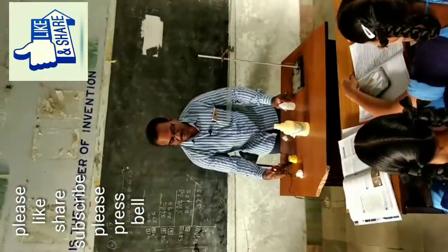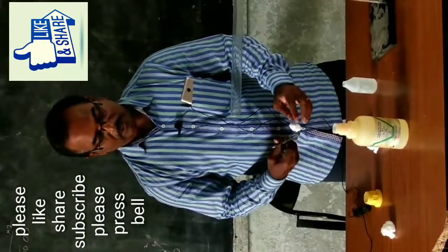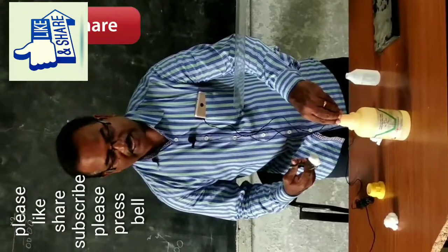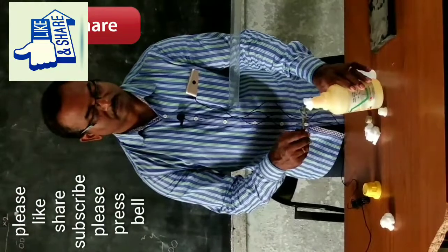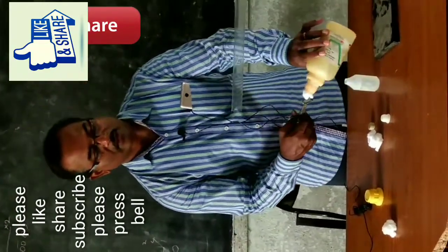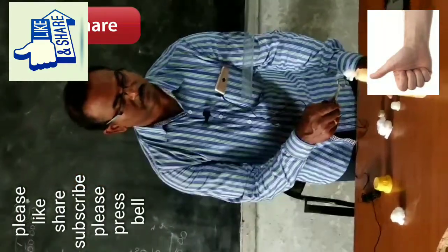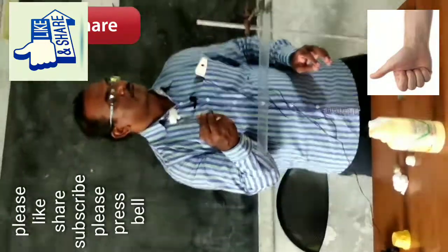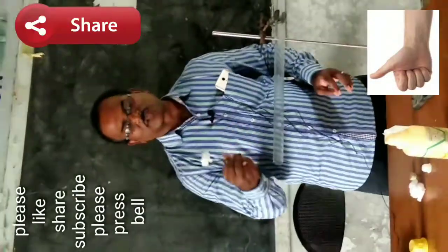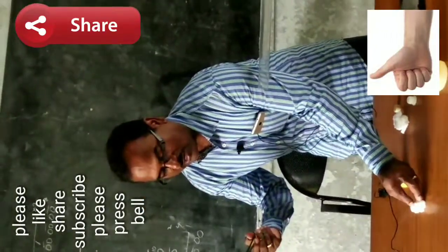Keep it aside. Then again, take another cotton ball and make it wet in the same way with the help of ammonia solution. This ball is filled with ammonia solution and this ball is filled with hydrochloric acid solution.